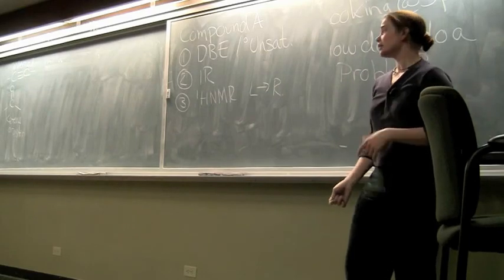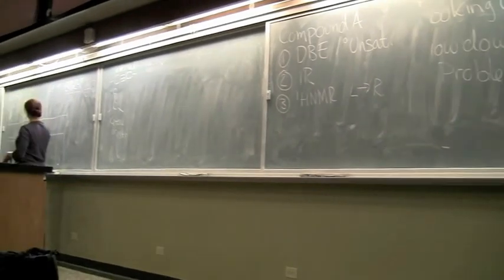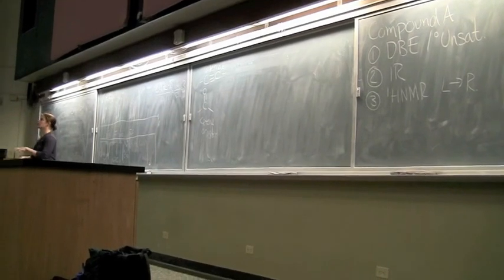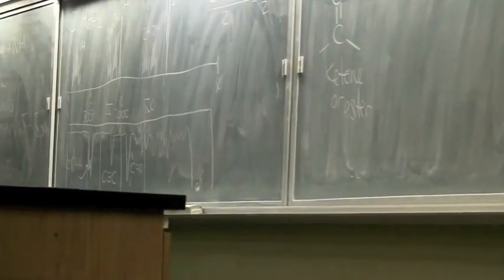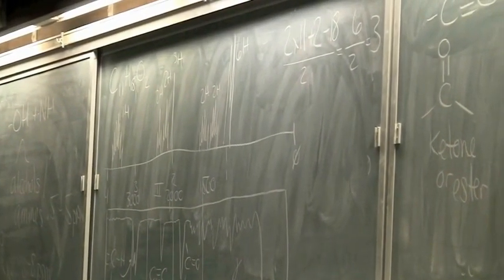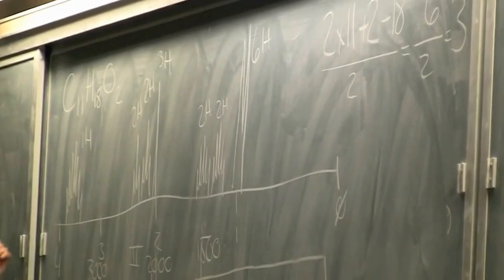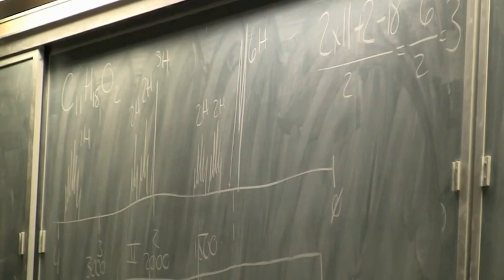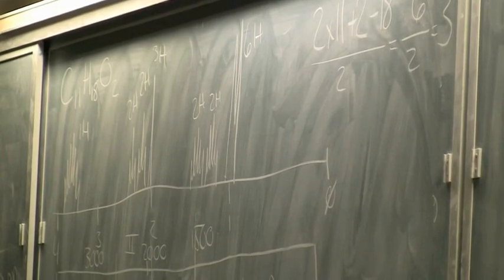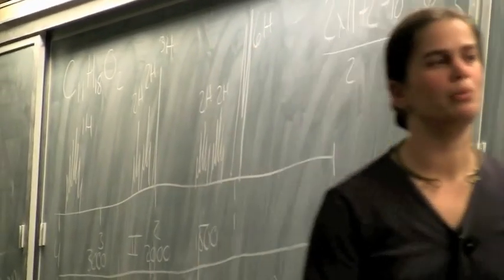Two, and more chemically, in a real spectrum, very often we don't get this nice, pretty, every peak is nice and separate thing. Very often in a real spectrum, those CH2s that are very similar are right on top of each other, and that makes them really hard to interpret. But stuff that's downfield, stuff that's got electronegative atoms, tends to be a lot more distinct. Chemists are lazy too. We do the easy parts first. So working left to right usually gives you the easy parts first, and anything that's left over, well, I have 3 carbons and 6 hydrogens, they must all be CH2s. We start to figure out from context, even if you can't see it well. So left to right is usually a good bet in a real spectrum anyway.